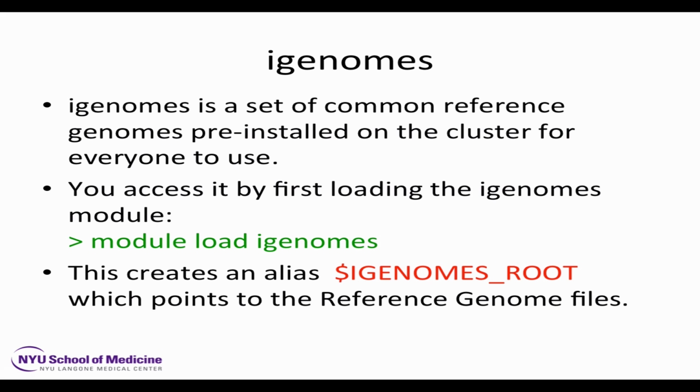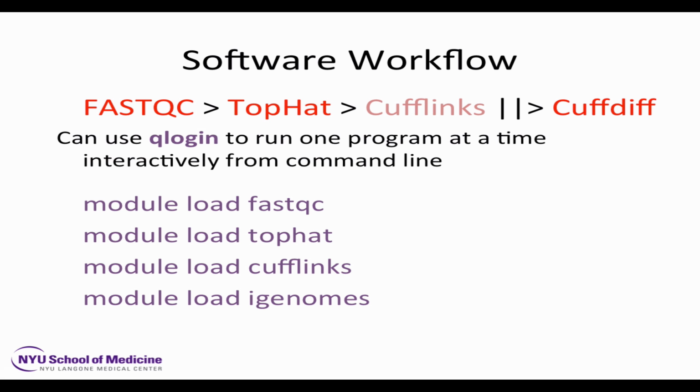Yes? How do we know what is loaded in iGenomes? I'm going to show you. That's what we're coming to. When I start writing the scripts, I'll show you how to take a tour of iGenomes just from your laptop so you can see what's there.